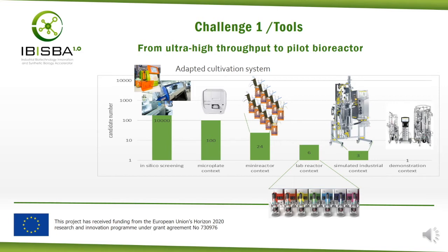Following screenings in microplate or mini bioreactor context concern criteria of substrate compatibility, growth rate, pH compatibility, and optimization compatibility, for example, compatibility with high substrate concentration, compatibility with fed batch mode, and DSP compatibility, for example, secretion of the product or co-product accumulation.